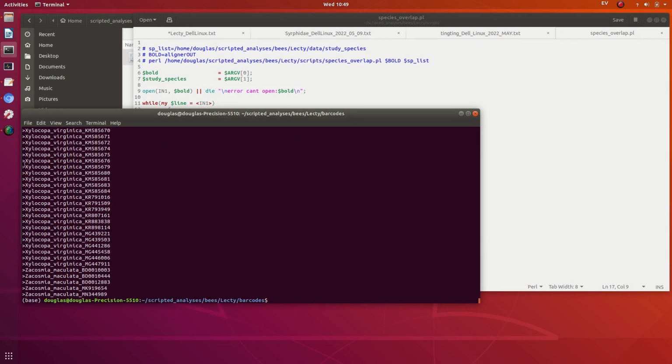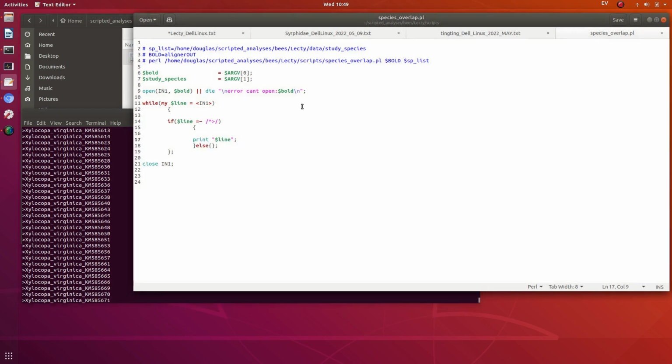So let's just pull out the binomial, genus and species, and then store these in a hash.